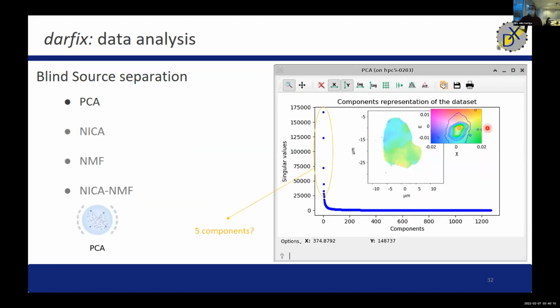So to sum up, before summing up, I want to tell you that you may think, why do we have the PCA implemented if it actually doesn't work well with our components? PCA is very good for dimensionality reduction. And this helps us because it helps us know how many components we can use for our data sets. How can we do that?